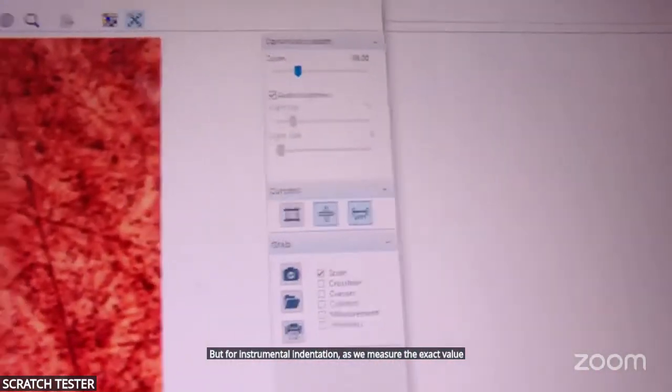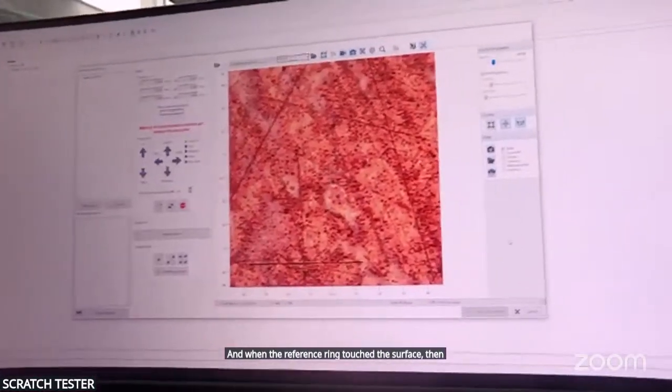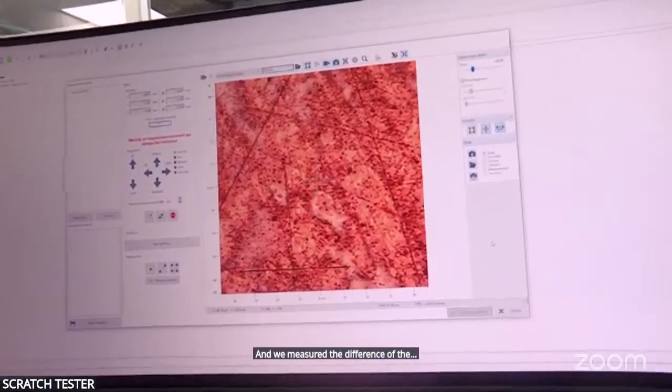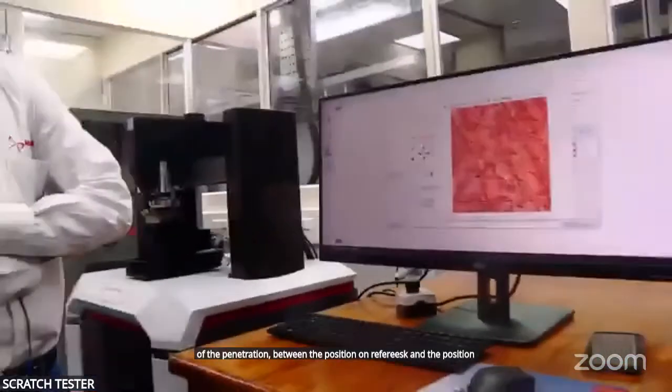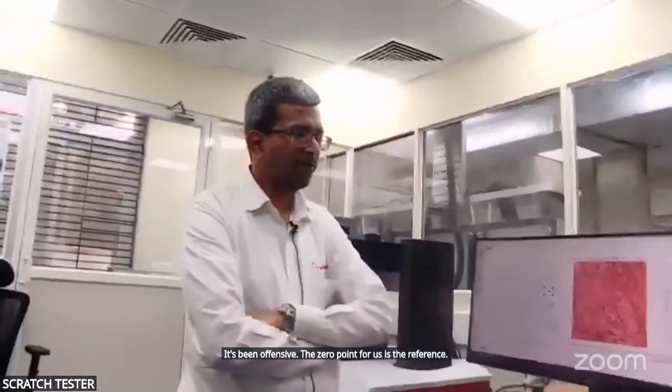But for instrumented indentation, as we measure the exact value of penetration depth, we need the reference ring, because the reference ring will touch the surface, okay? And when the reference ring touches the surface, then the indenter starts to move. And we measure the difference of the penetration depth between the position of the reference and the position of the indenter. The reference is the 0 point. The 0 point for us is the reference. This is why we need it.